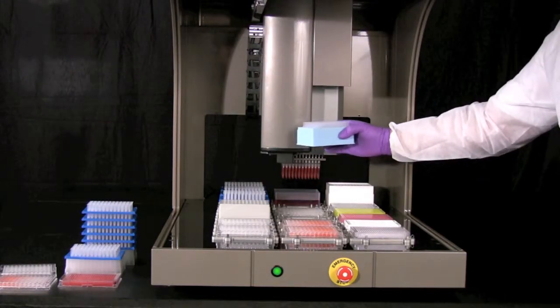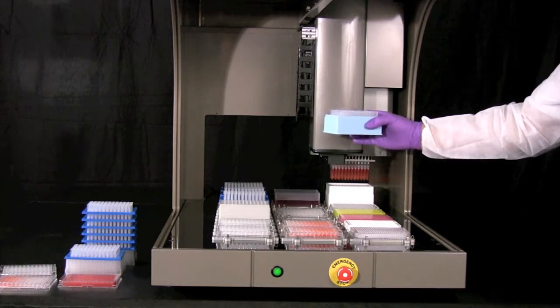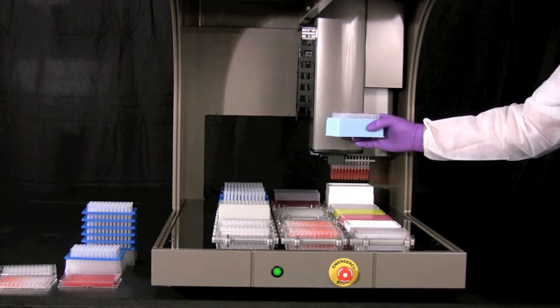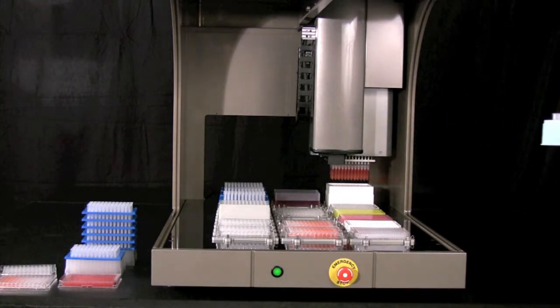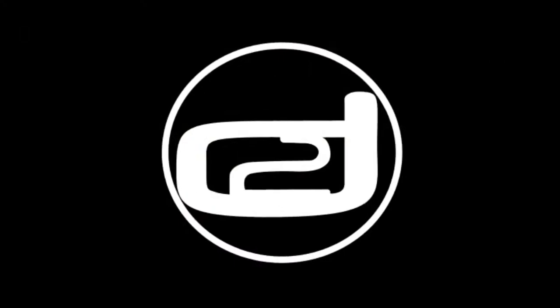Here again is another quick example of how Dynamic Devices' implementation of linear motors adds to the safety of the equipment and to the ease of use. By simply hitting continue, the system will continue to pipette samples properly and continue the methods without interruption.